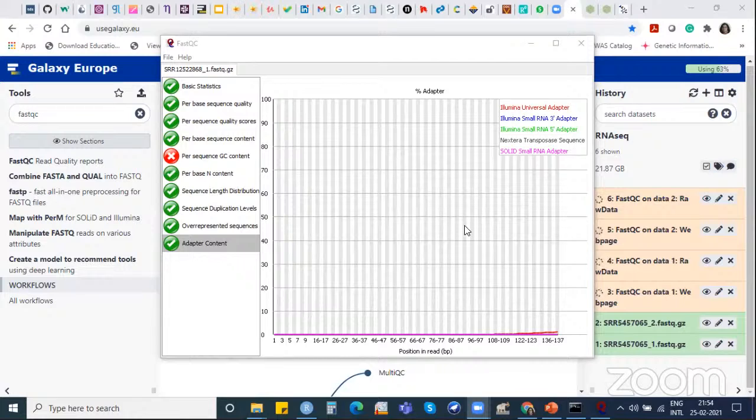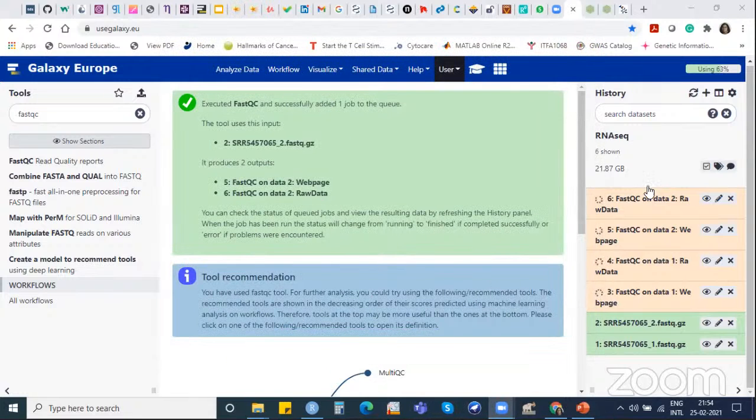This is the initial QC report. If you see the adapters or any other things, then you have to remove those adapters using Cutadapt, and then again you have to come back to this particular tool, whatever the filtered files are there, do the QC in that and visualize whether still adapters are there or not. If not, then we can proceed further for the downstream analysis.